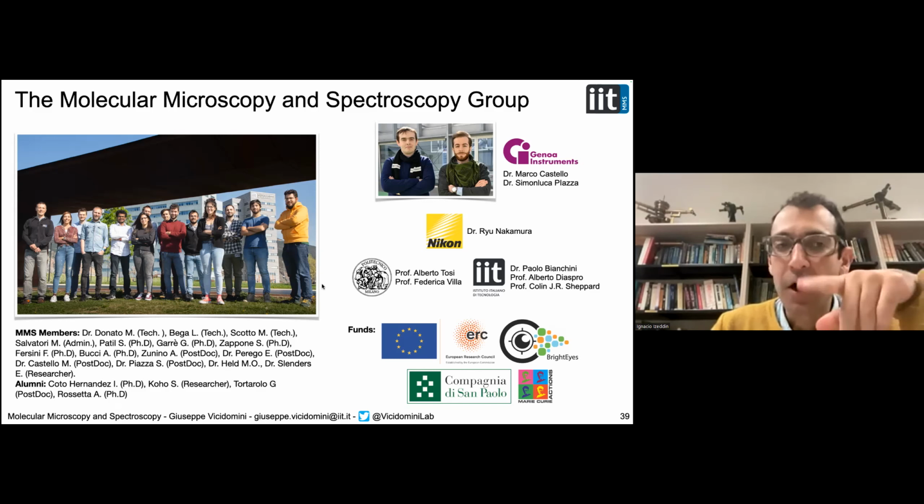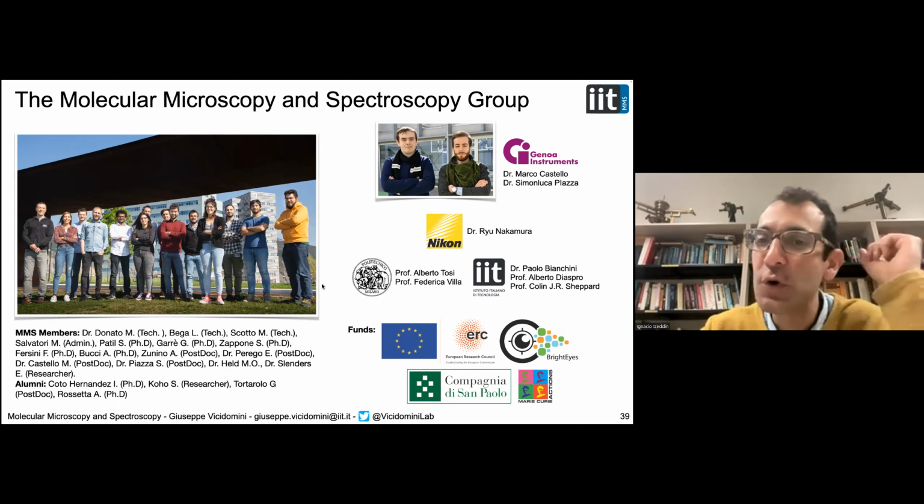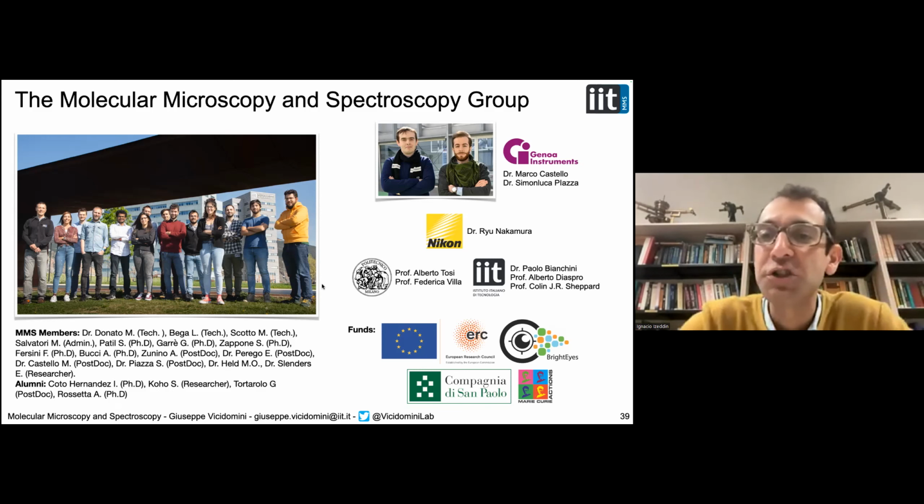Okay. There are a couple of questions in the chat. There is Huyen Shu who is asking, does the array detector change axial resolution? And I have a somewhat related question from Aurélien Barbotan, who is asking about the penetration depth. How well does image scanning microscopy handle aberrations and light scattering as compared to confocal?